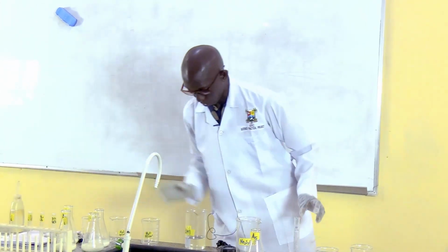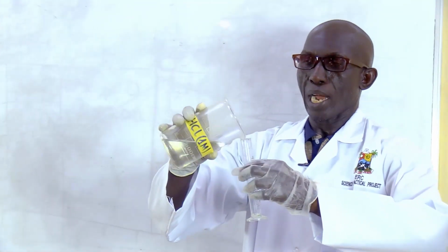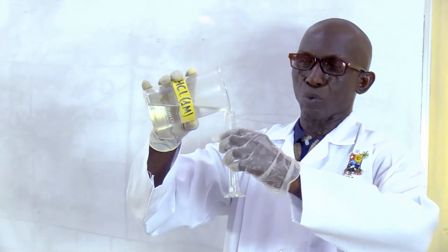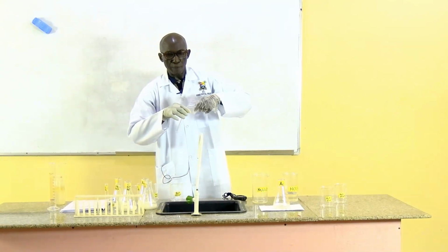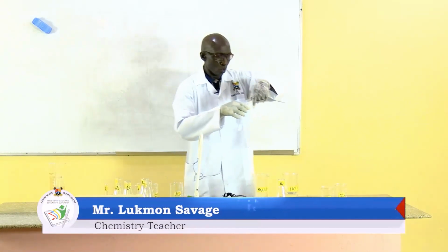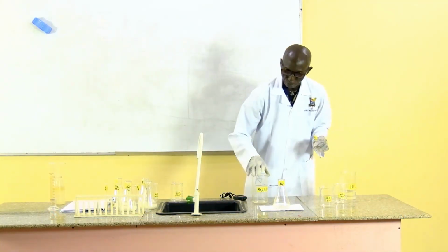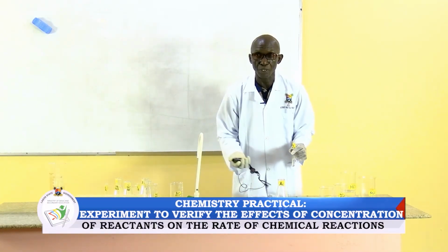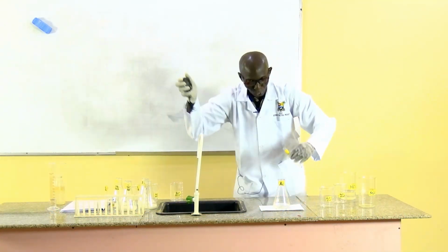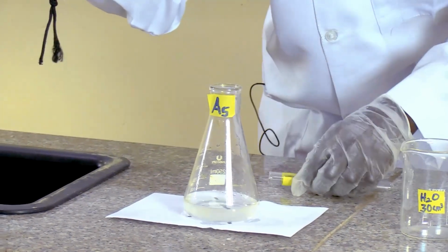5 cubic cm. So this is my dilute hydrochloric acid, 1 molar solution. So I want to measure 5 cubic cm of it, just as we had in other beakers. So I have 5 cubic cm of my hydrochloric acid here. So the hydrochloric acid, I'm going to pour it, the 5 cubic cm, into the content of the conical flask. And note my time, the time taken for the reaction to occur. You will agree with me that this is a very interesting chemistry experiment. So let's count, watch out. When I pour it in it, then I'm going to take the time. Start. The reaction has started.